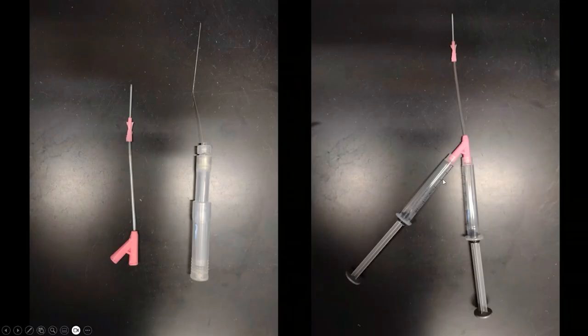The syringes have to be pulled out, and then the agar will be added in as they are vertical, and the agar will remain liquefied for several minutes because it is at 42 degrees. It'll take some time to cool, and that will happen when it gets injected into the mouse lung.